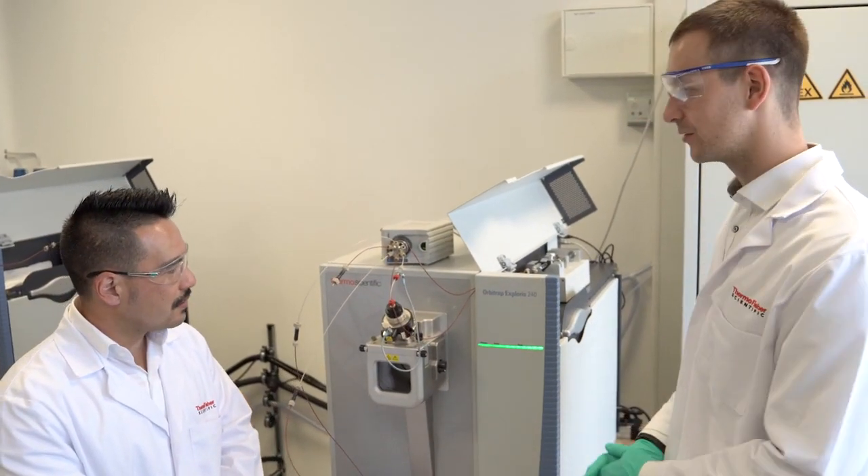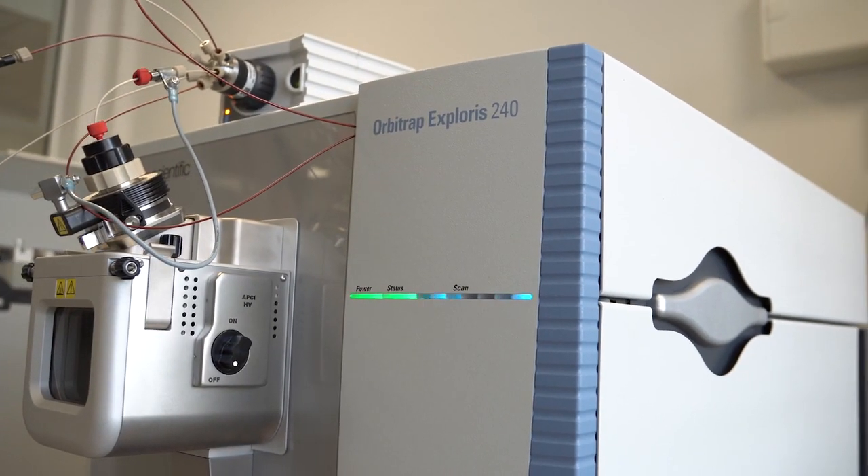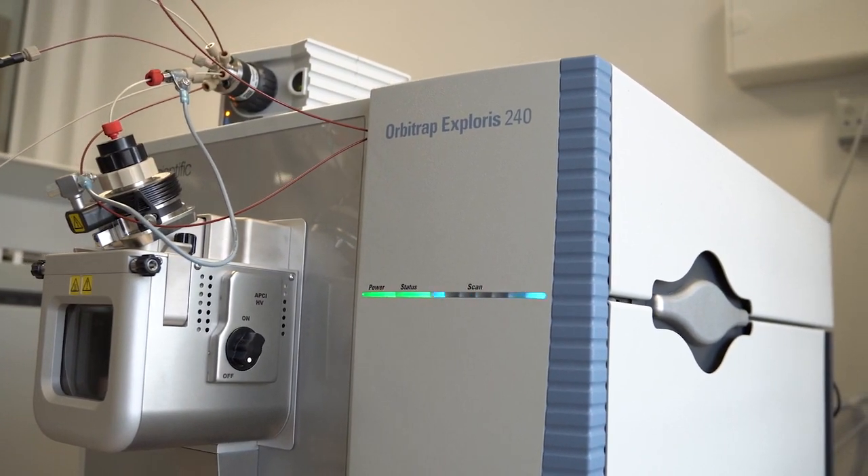For over 75 years we've been producing mass spectrometers, peripherals, applications and methodology to do isotope ratio measurements. What we'd like to share with you today is the next offering to complement our portfolio of isotope ratio mass spectrometers.